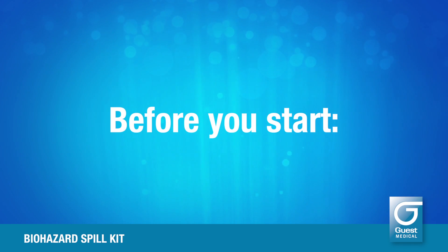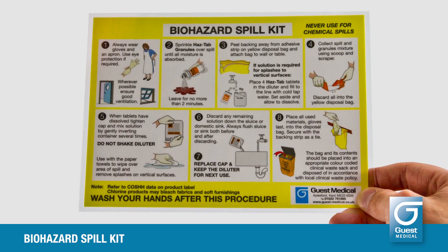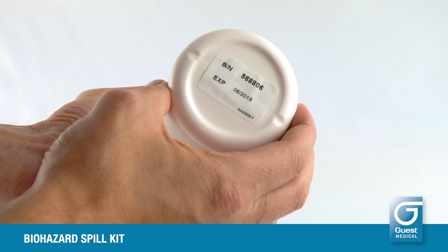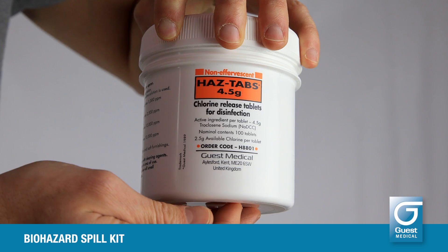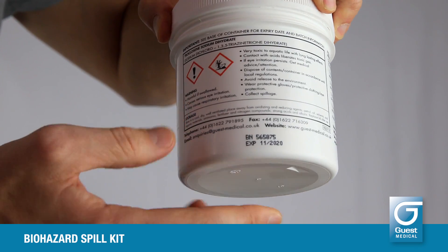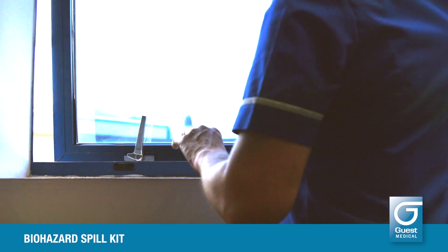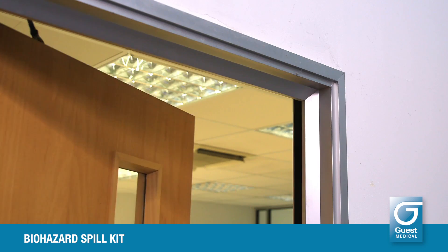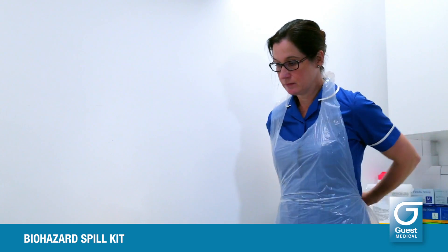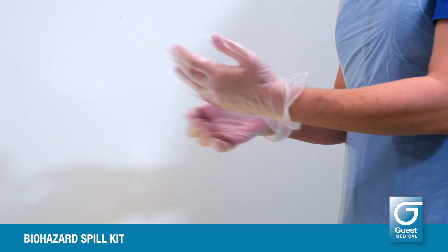Before you start, check the instruction card carefully. Always check the expiry dates on the Haz-Tabs products before you use them. Wherever possible, improve ventilation in the area of use. Always wear the protective gloves and apron provided in the kit box. Wear face protection if there is a danger of splashing.